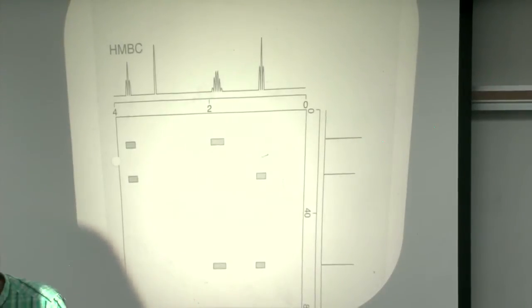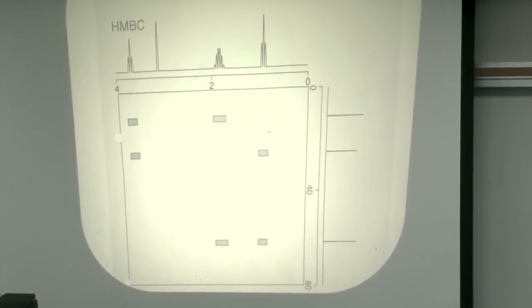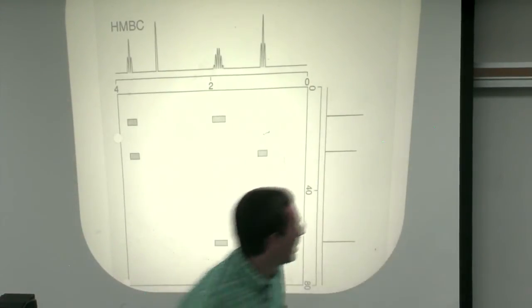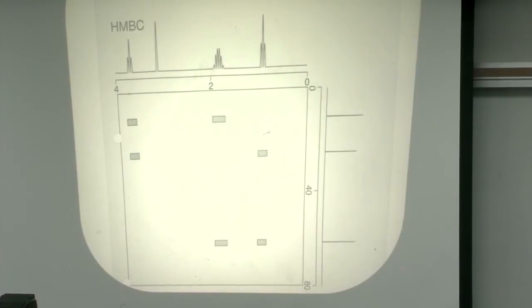All right, the last one in our schematic, now we come to our HMBC. And let me again sort of show you in my simple-minded view on the blackboard here. So again, we'll come back to our molecule. HMBC can be like drinking from a fire hose.